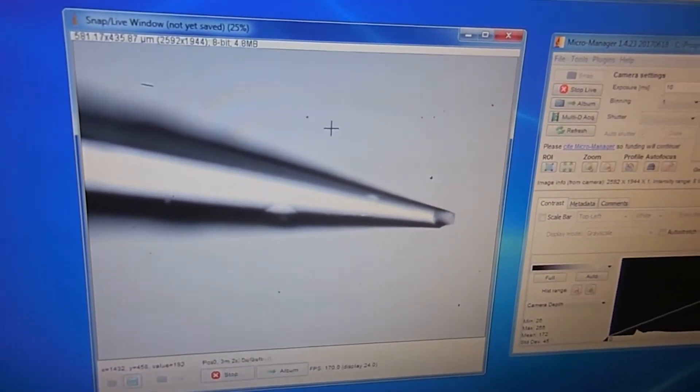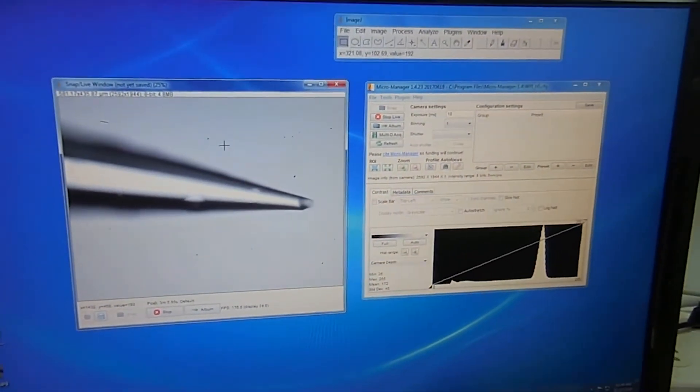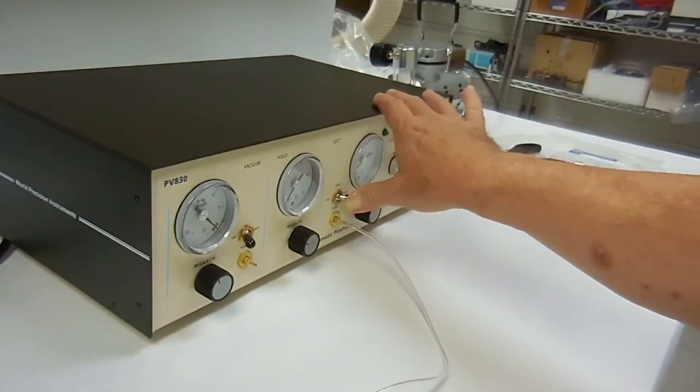That's capillary action right now that's open to atmosphere. I'm going to back off the hold regulator again, put the hold pressure back on, switch, and go back over to the image.